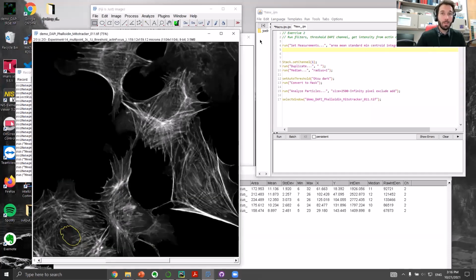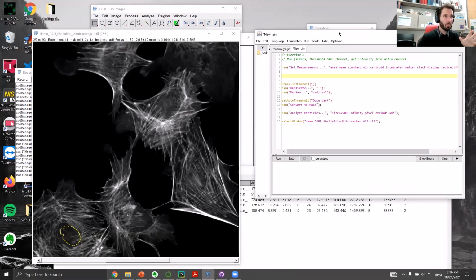And another way would be to essentially use variables. We haven't really used any yet. A variable, if you remember from your algebra, is just a symbol that contains something. From algebra, it was usually a number. And in programming, it can contain anything: a number, a bit of text, or in the case of ImageJ, you can also store an image.